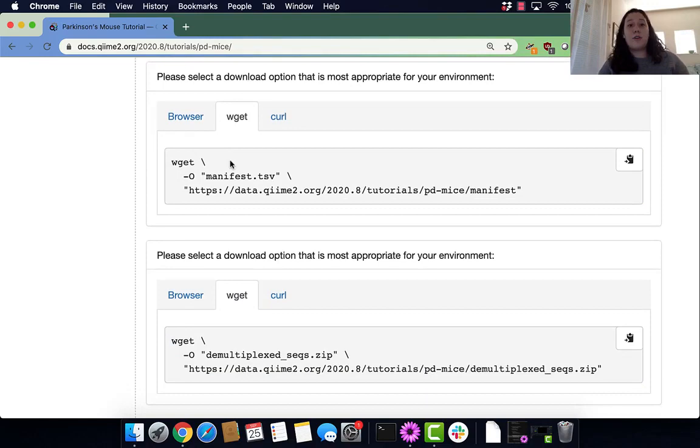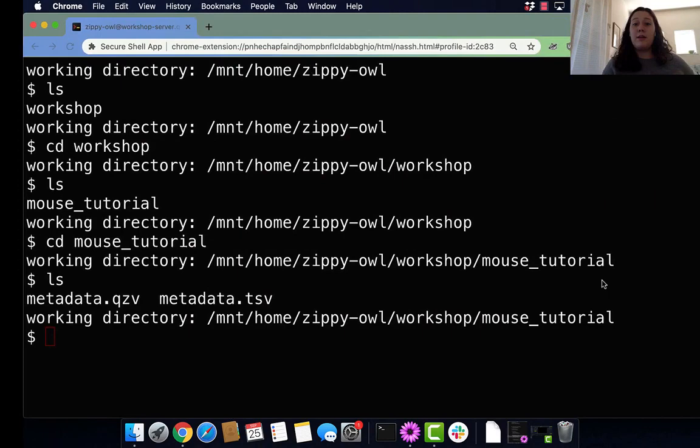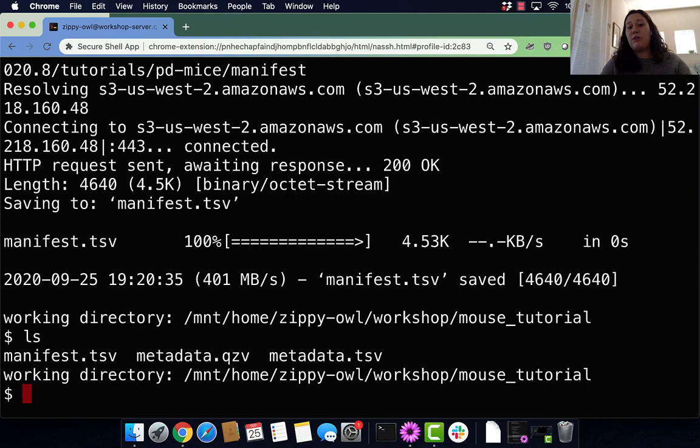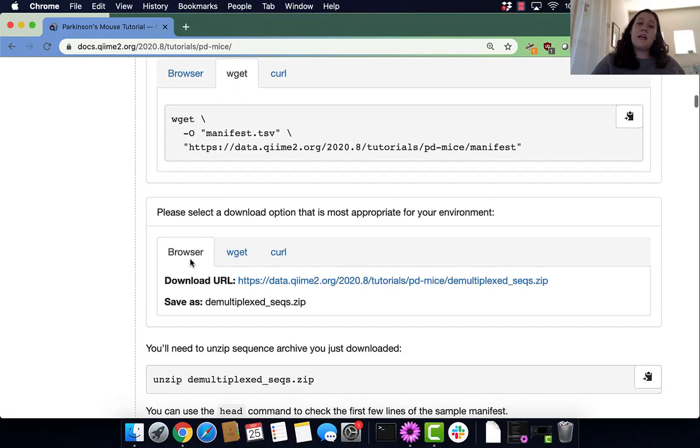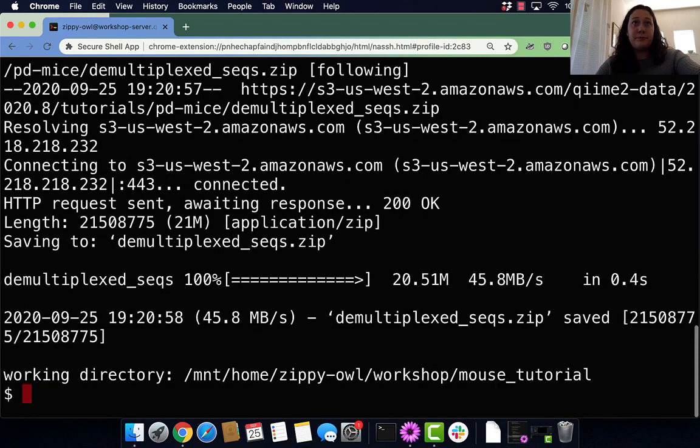First off, we are going to download some files from the internet. I'm going to use wget and copy and paste that, run it, and then run the command ls to see if that data actually downloaded. We can see that it did. Now let's download our sequences, doing the exact same thing.